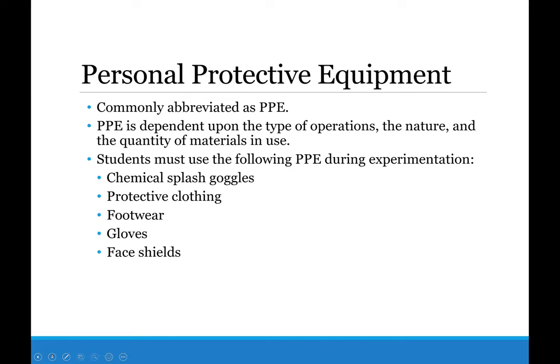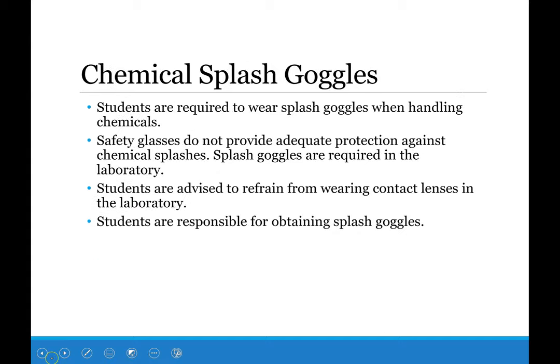PPE — personal protective equipment — is what we wear to prevent ourselves from getting hurt. Chemical splash goggles are the typical large laboratory goggles that prevent splashes when working with chemicals. Safety glasses are not allowed in the lab because they don't adequately protect against splashes and spills. You are responsible for getting your own safety goggles; we cannot provide them this semester due to potential COVID-19 cross-contamination, but you can get them cheaply at Home Depot or Lowe's for less than $5.